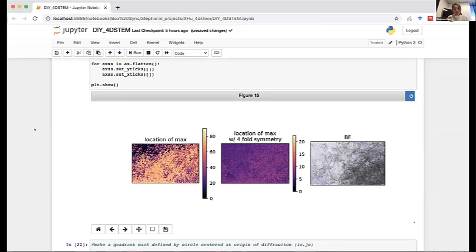Totally. And I think that Python is a really good tool to do that, because when you have an idea like that, you can start to think about how to build your own detector or collect that kind of information in a different way. We're about to talk about how you can use a quadrant detector to collect information about what's on opposite sides of your sample.